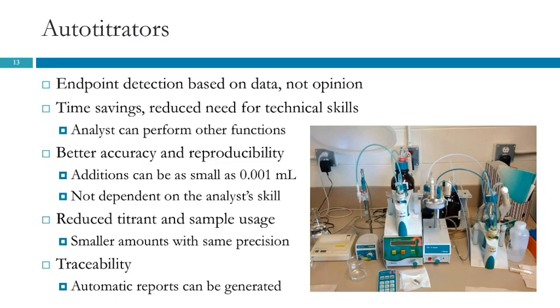There are auto titrators that have auto samplers so that they can sample and titrate multiple samples. Those, of course, would cost more money. And there are others where you would prepare the sample, stick it in there, and start the machine. But then there's at least a couple of minutes while it does its thing that you could be attending to something else, preparing the next sample or whatever. So it can save time.